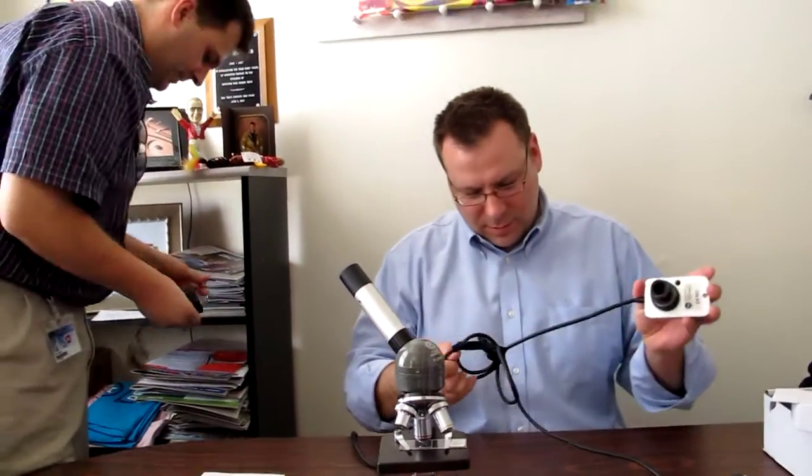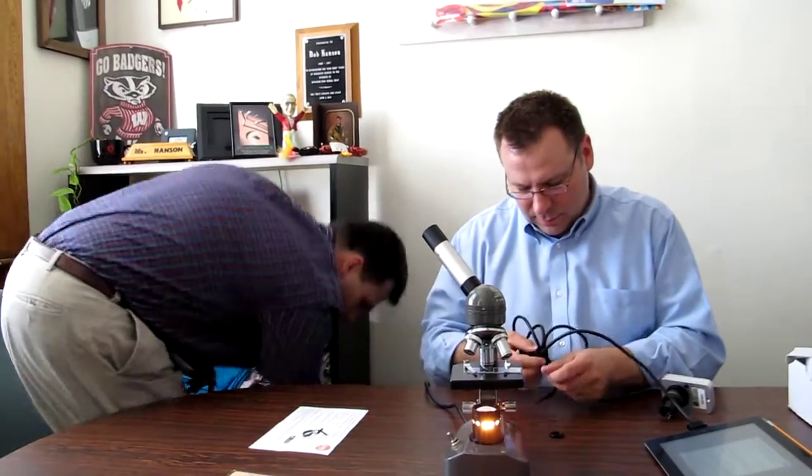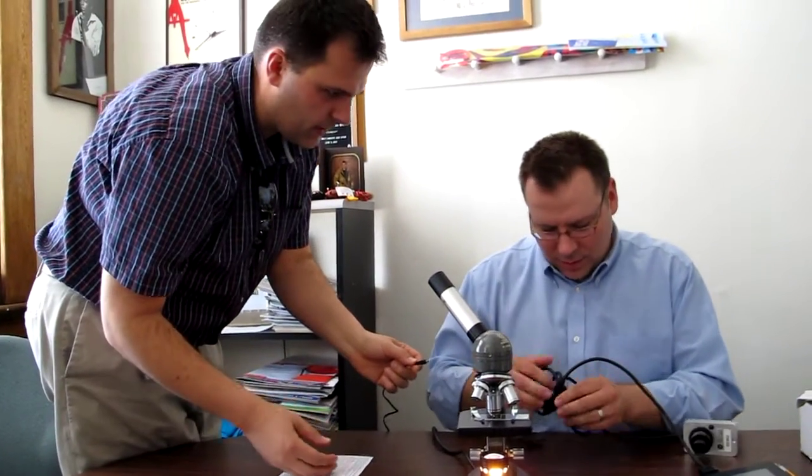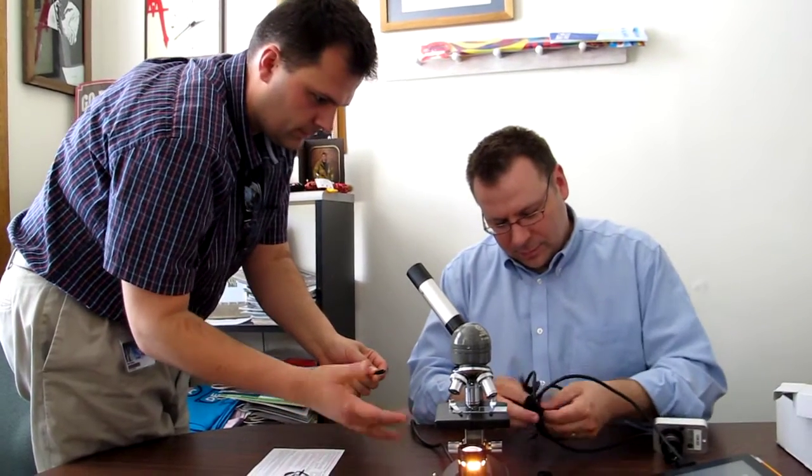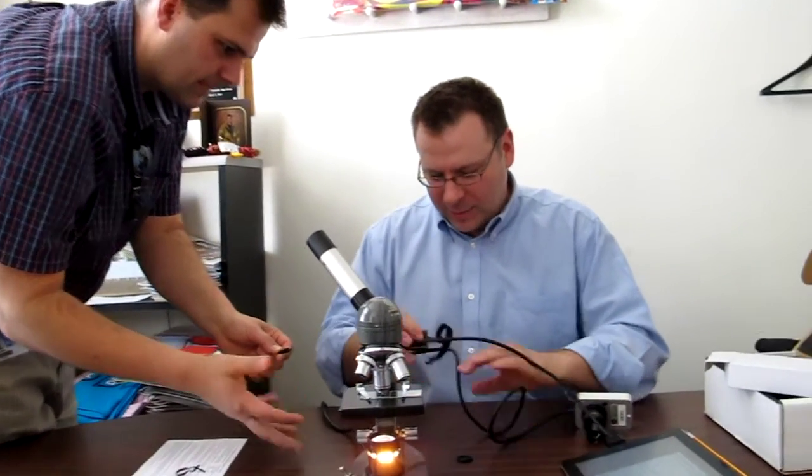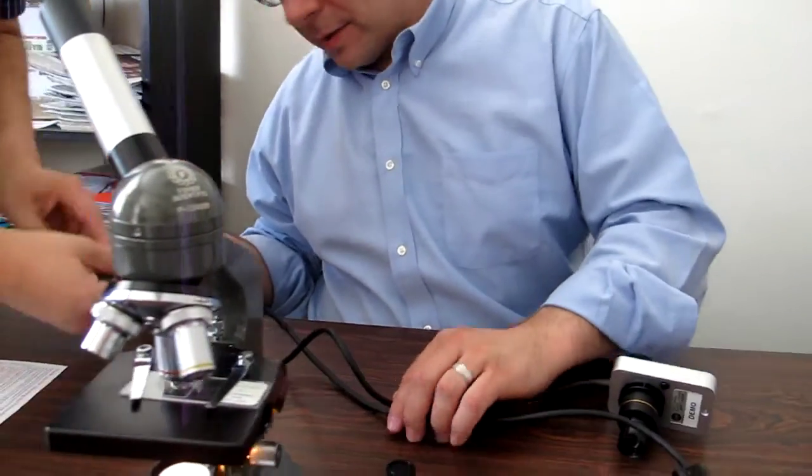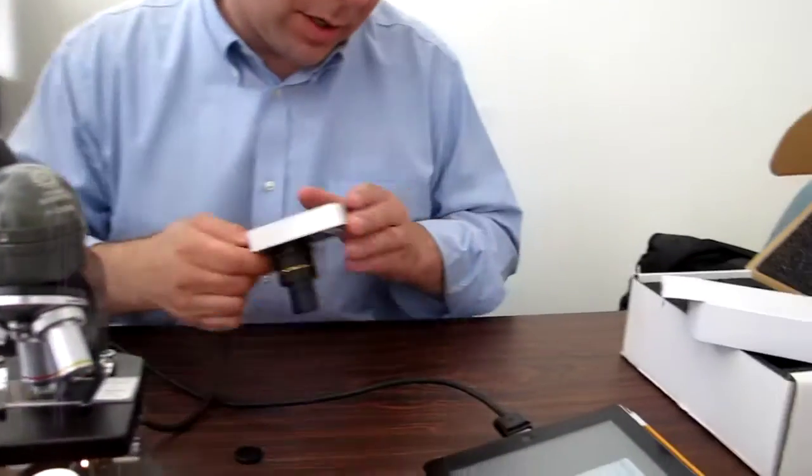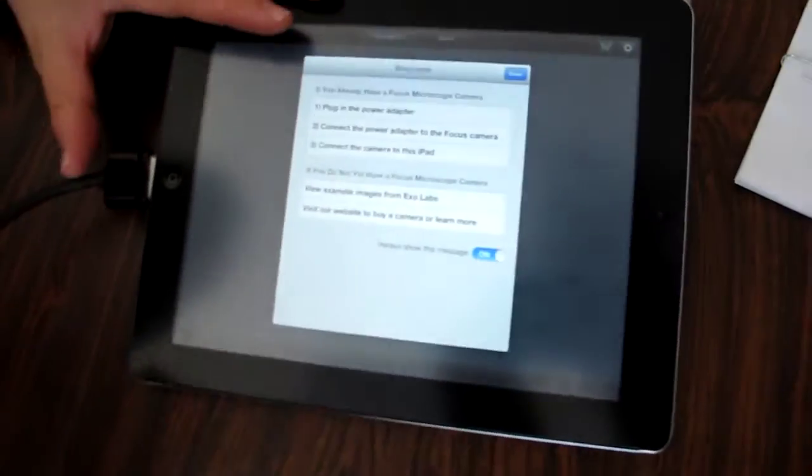Preparing the power adapter. Where is this going? Oh it goes right in here. So there is another piece in here. Just, triple XO patience, patience. Okay, plugs in right there. Okay, now we're good here and connect the camera to the iPad.